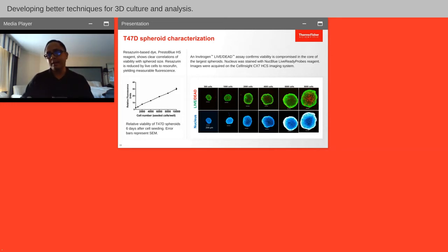So I think that these images, along with the bright field images, give you an idea of what the cells should look like, but also the relative health of the cells based on your length in culture and also your seeding density. So it gives you some options, depending on your experimental parameters, of how long you should have your protocol run for.